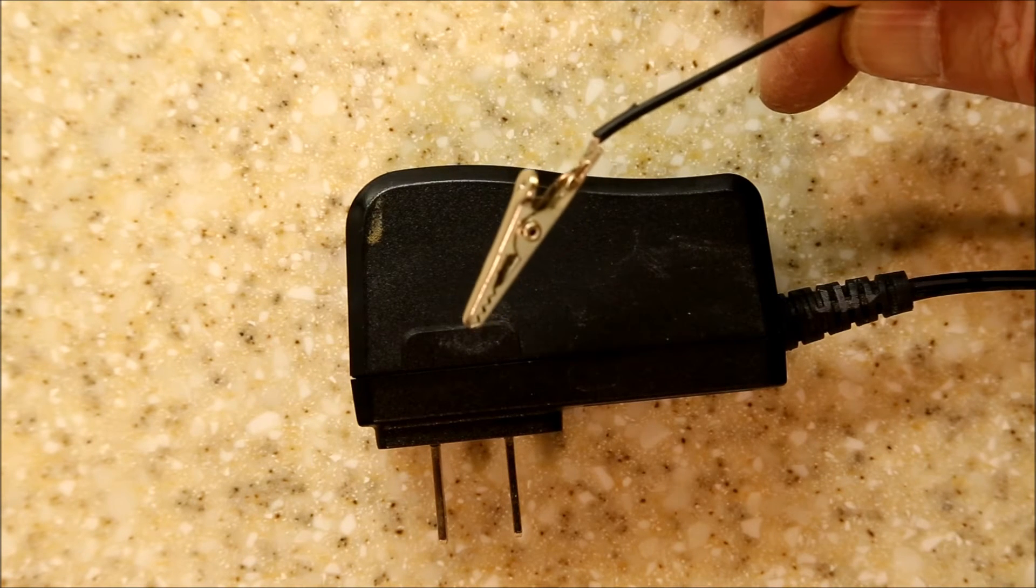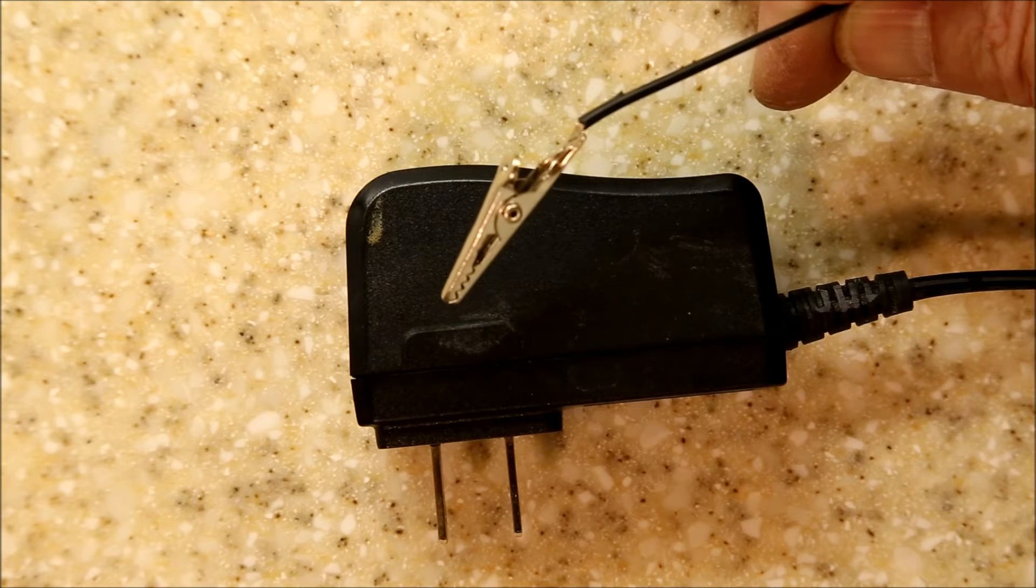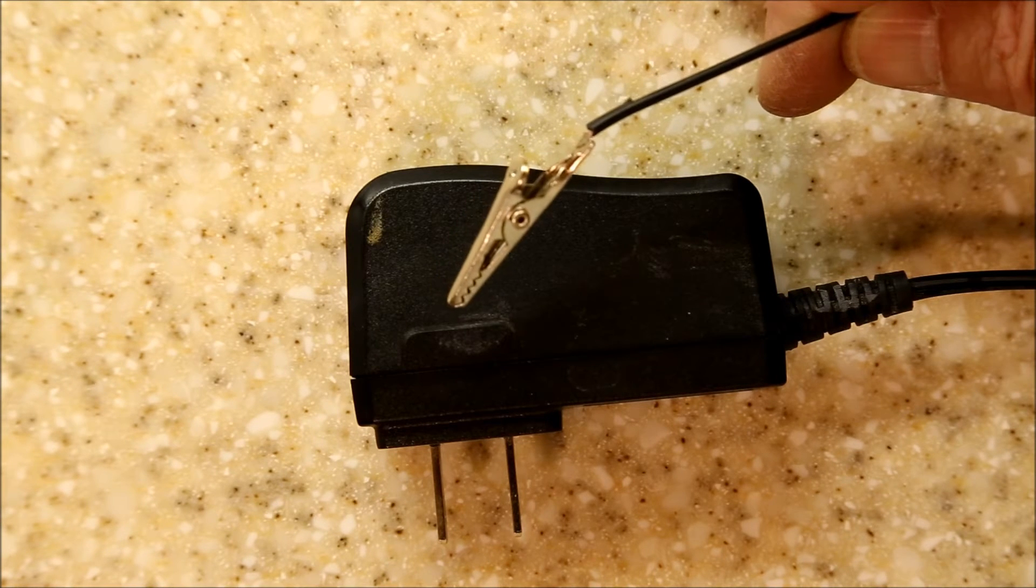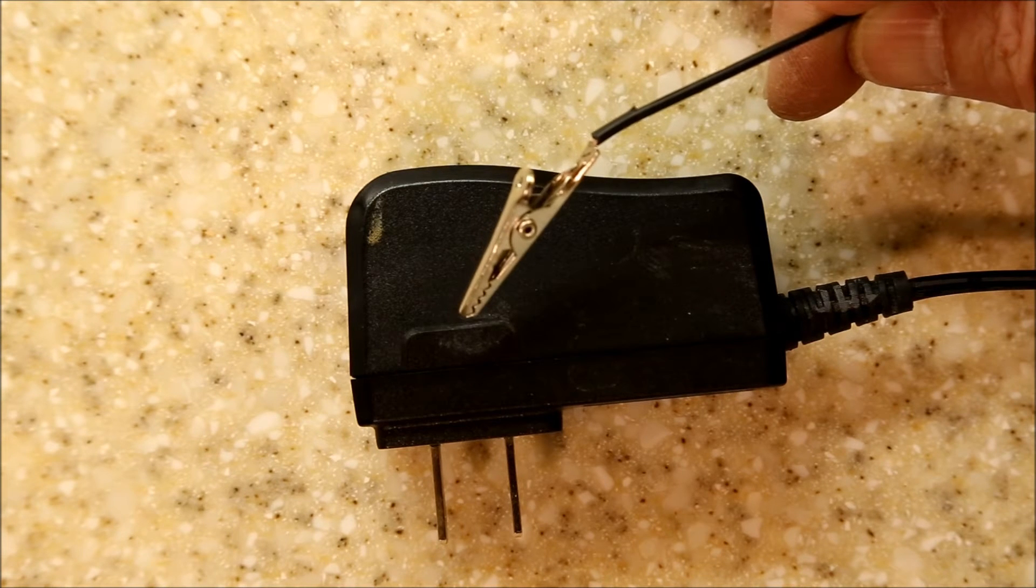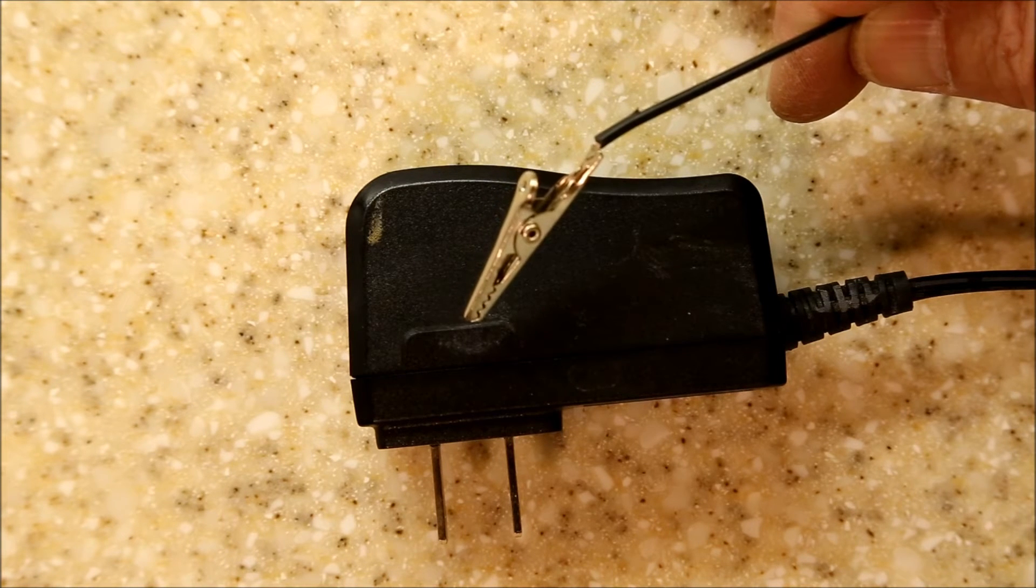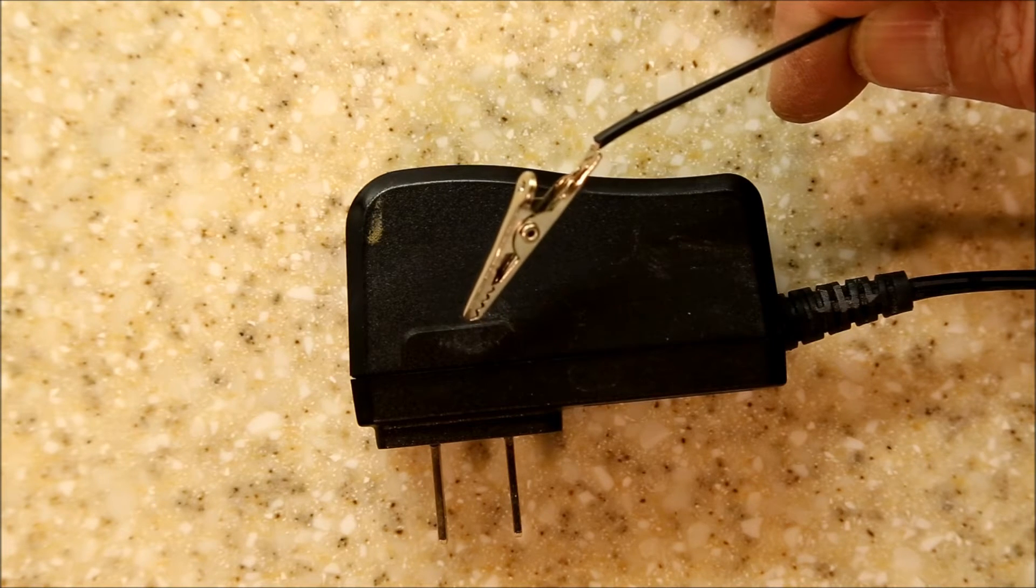Attaching alligator clips to the end will make it easy to attach them and detach them from your electrodes, but this isn't really necessary. Most of these come with socket ends, and you can usually figure out a way to make electrical contact with the inside and outside without shorting it out.